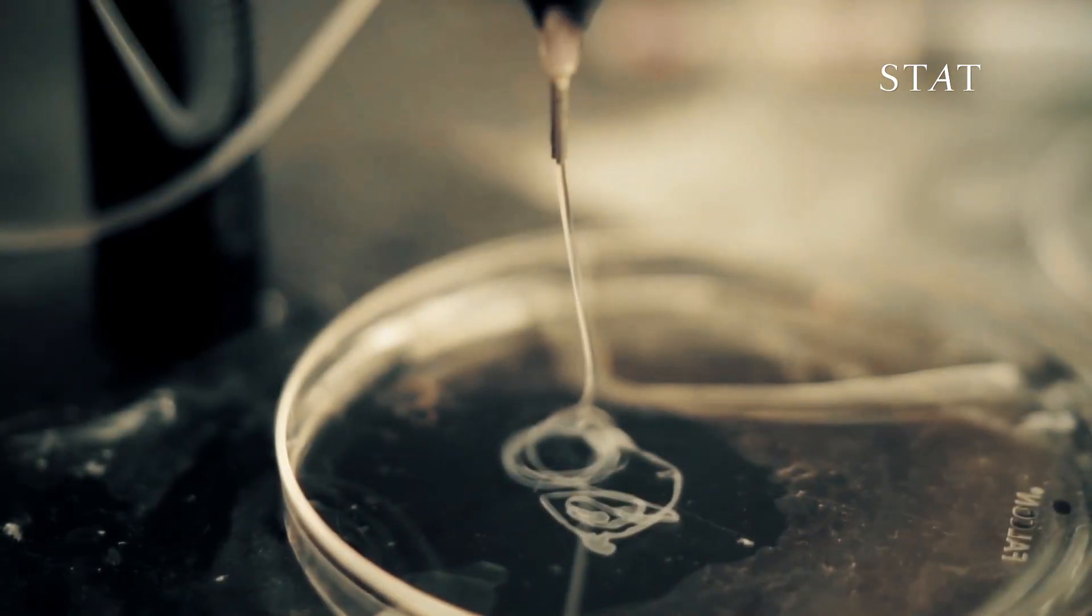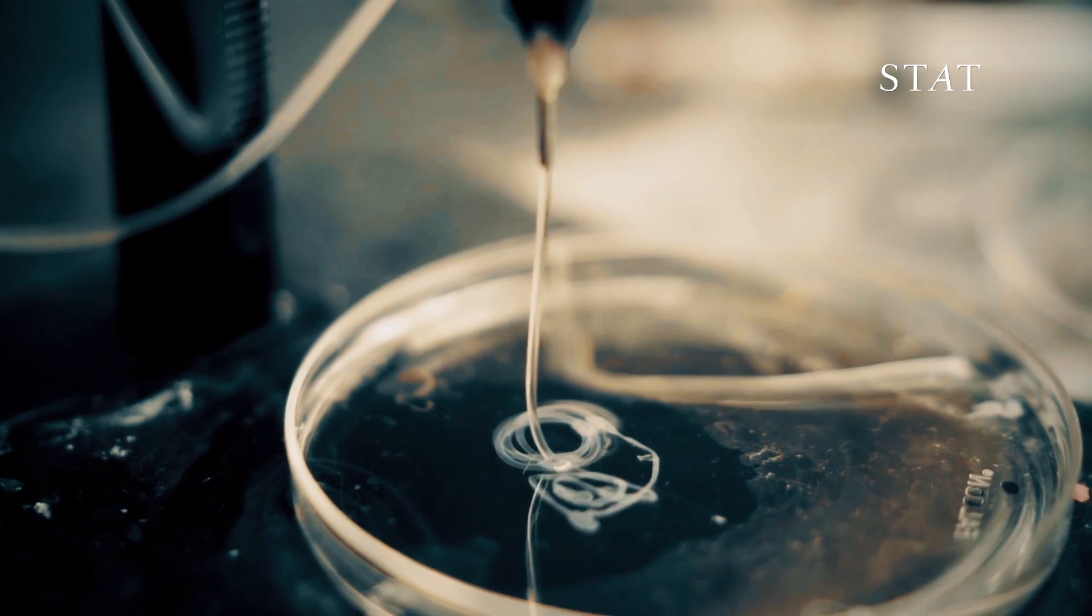To help solve this, researchers at Brigham and Women's Hospital have developed a way to print blood vessels with ink made out of gel and human cells.